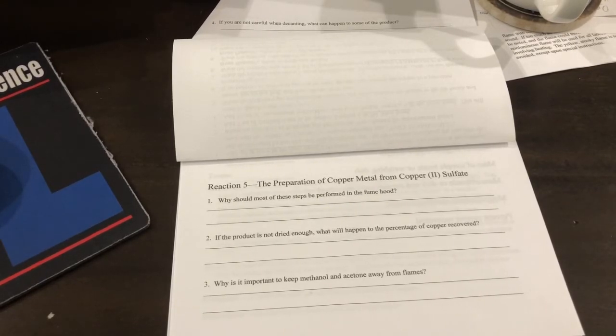Why should most of the steps be performed in the fume hood? The purpose of a fume hood is to suck and to ventilate the harmful fumes that are produced from some of these reactions. If the product is not dried enough, what will happen to the percentage of copper recovered? Well, it could have a false reading and it could weigh more than what was actually recovered. So that's why we put it in the oven for 20 to 30 minutes to make sure it's really, really dry. Why is it important to keep methanol and acetone away from flames? Well, they're flammable.